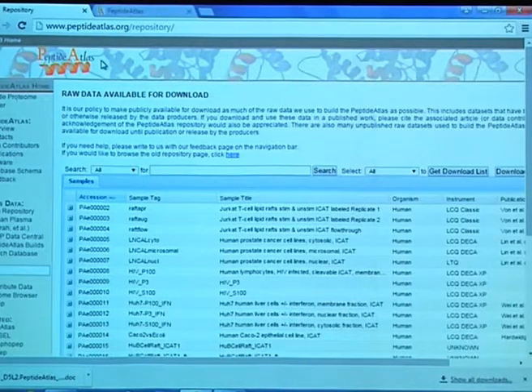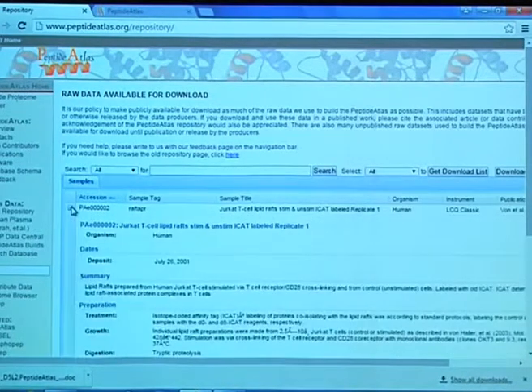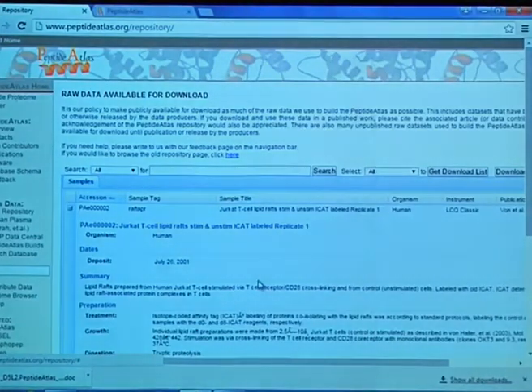But this is what it looks like, as we went over before. So what's easier to see, the mouse or the pointer? Doesn't really matter. Each accession has this PAE accession, and I'm going to go ahead and open up this one. You can see that underneath that experiment there's quite a bit of additional information.